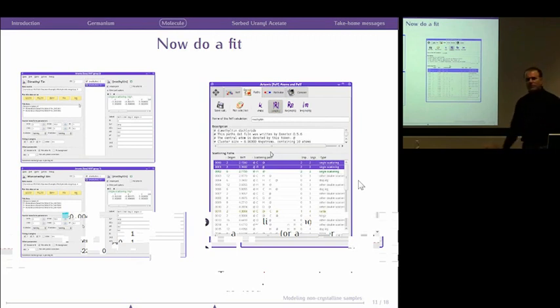So there was an example of something that is certainly not a crystal, but for which we have structural information. And you can convert that structural information directly into a Feff input file and carry on. And so if you have something that's reasonably close to your material, you run Feff on that, parameterize it to account for the differences, run a fit, and publish the structure of your material.